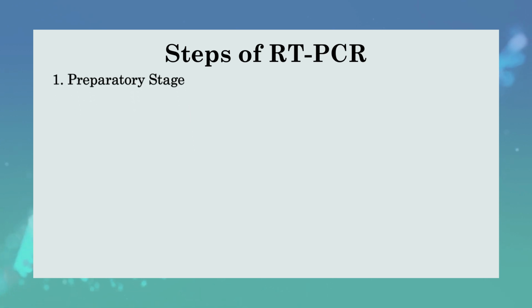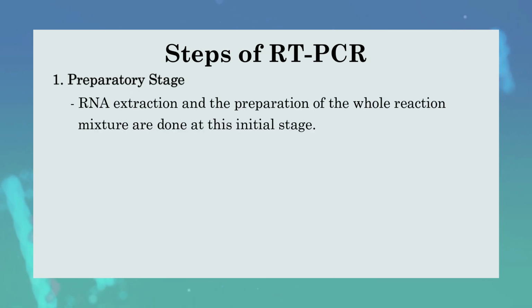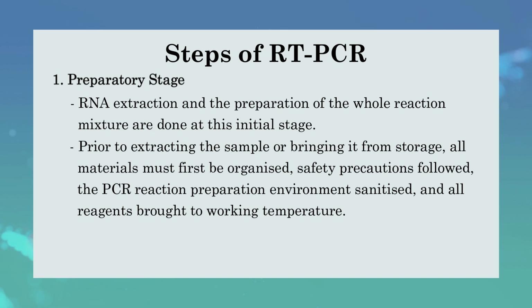Number 1, preparatory stage. RNA extraction and the preparation of the whole reaction mixture are done at this initial stage. Prior to extracting the sample or bringing it from storage, all materials must be organized, safety precautions followed, and the PCR reaction preparation environment sanitized and all reagents brought to working temperature.